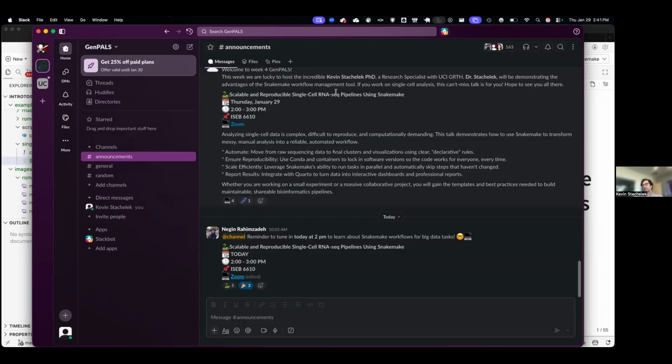If you're not interested in getting into those, then just take an existing repository and go through it step by step. There are many single cell instances of Snakemake profiles, but even, as I said, that ARMOR pipeline from 2019, I think it's Charlotte Soneson. That's a great example. It's very easy to follow. It's designed for bulk RNA-seq, but it's pretty adaptable. And the essential steps, like the initial processing and running FastQC and MultiQC, are going to be the same.